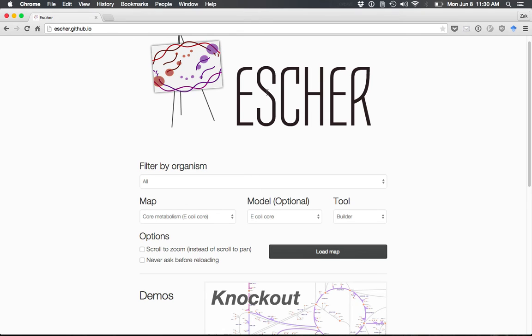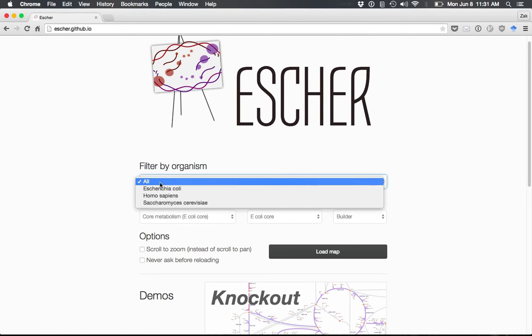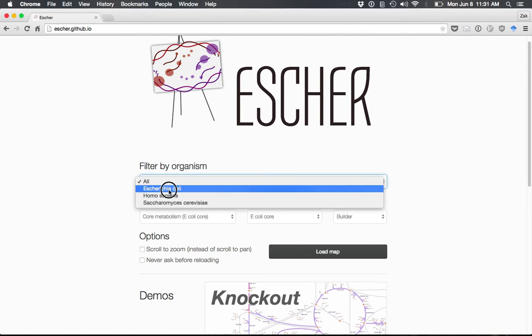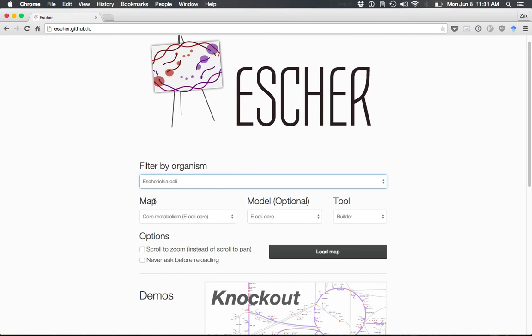On the launch screen, you can choose a map, which represents the layout of the visualization you're going to view. You can filter those maps by organism, such as E. coli maps, and choose a model representing all the reactions in the organism you might want to build.